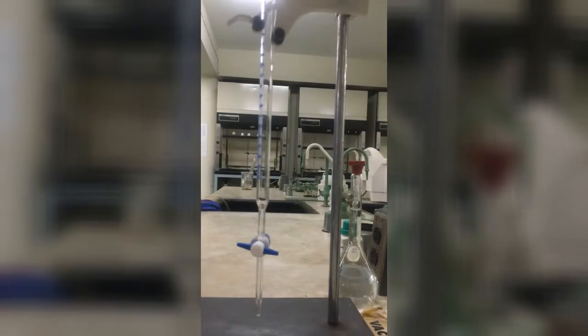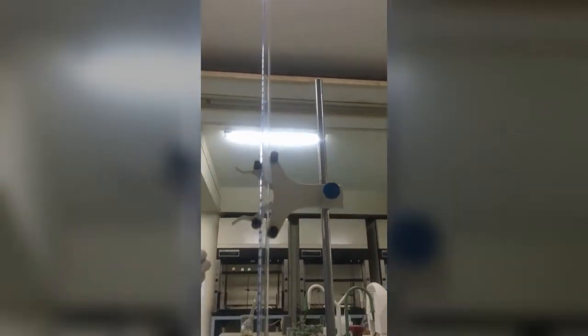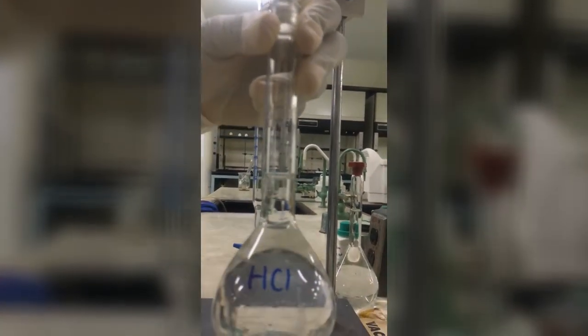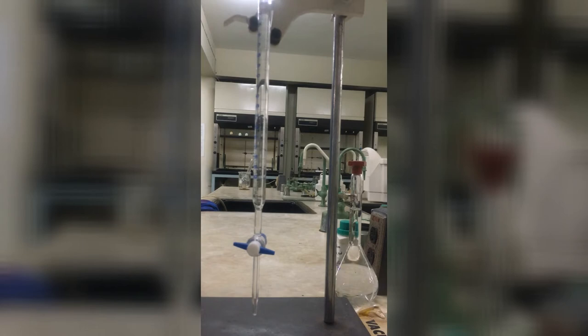Now we are filling our burette with the hydrochloric acid. Of course, we conditioned the burette beforehand with the dilute hydrochloric solution. Conditioning essentially reduces the probability of contamination of your solution. Just to mention that when you are filling your burette, don't fill to the zero mark — this will affect how you estimate your initial reading to the nearest two decimal places.